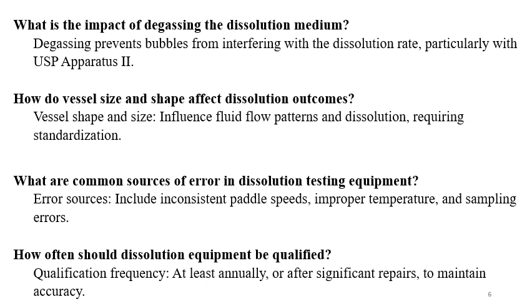How do vessel size and shape affect dissolution outcomes? Vessel shape and size, you can say it as dissolution bowl shape and size, influences fluid flow patterns and dissolution, requiring standardization.